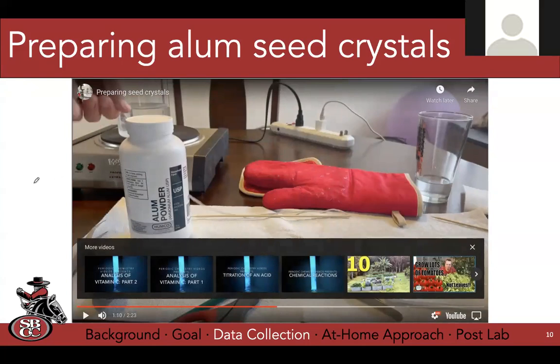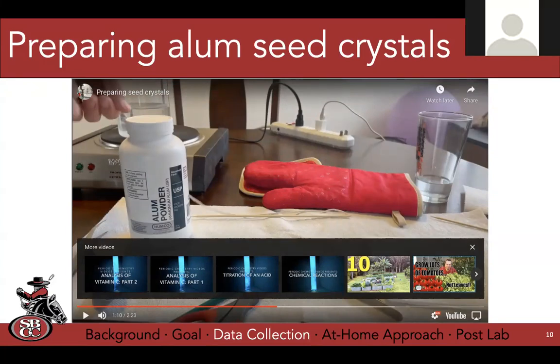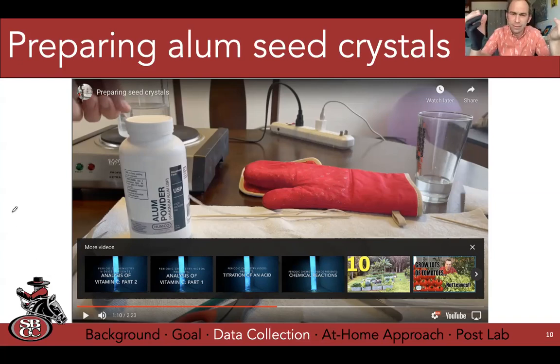Yeah, I had a question about forming the seed crystals themselves. If you're trying to make it easier to have a nucleation site, such as the one you're doing right now, would it be better to suspend a piece of the string in the solution while you're trying to get the seed crystals so that some may form on that string itself? So then you can just drop that into the new solution? That's brilliant. That's a really good idea. I remember doing that with sugar crystals. Yeah. Back in the day.